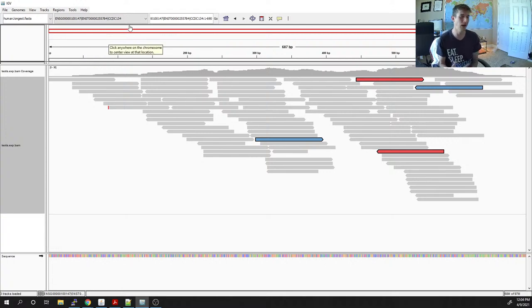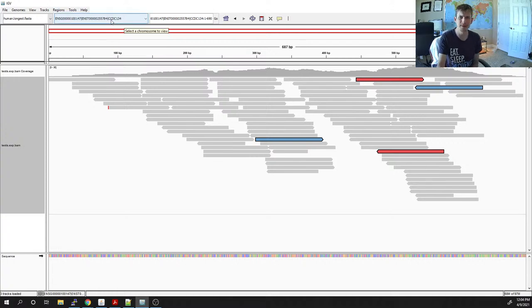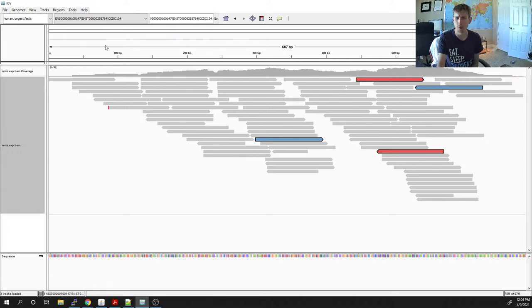We have this entire transcript across the top for a specific gene. I've mapped these reads to a reference created by Ensembl — this is a human CDS reference sequence, not one that we made, just using it as an example. This specific gene is the Ensembl gene CCDC134.